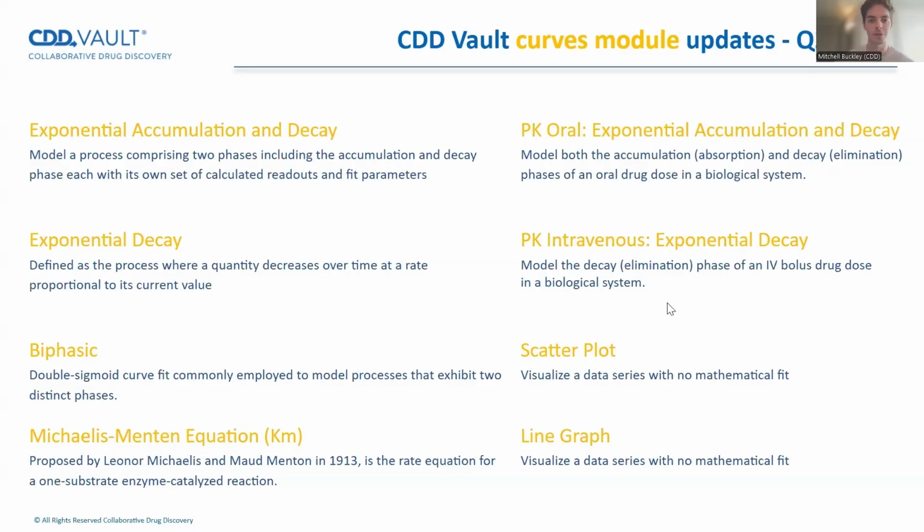Hey everyone, my name's Mitchell Buckley. I'm one of the application scientists here at CDD Vault, and today I'll be covering some of the newest features within the Curves module, which is a great place for users to streamline data analytics, all within the safety and the convenience of CDD Vault.